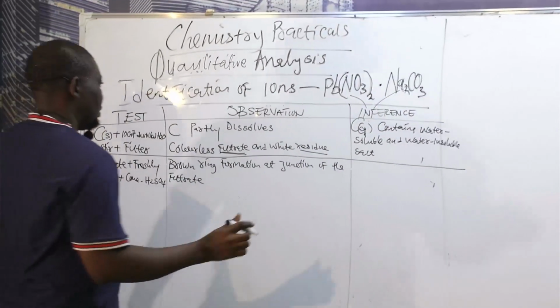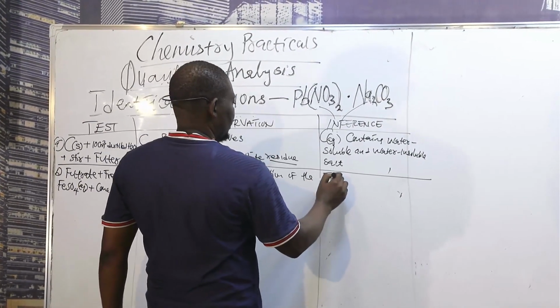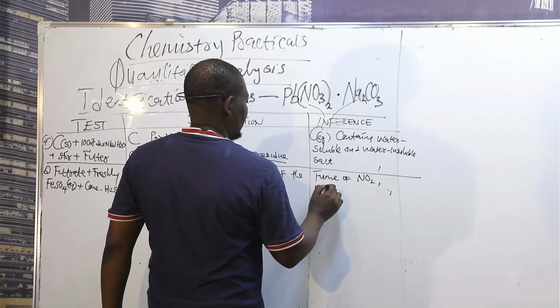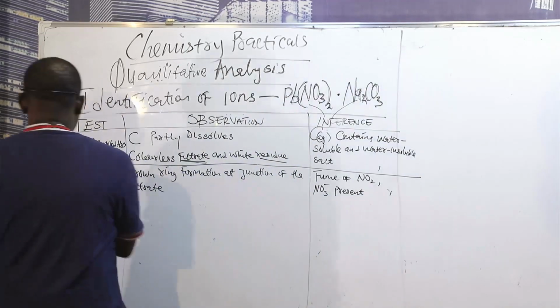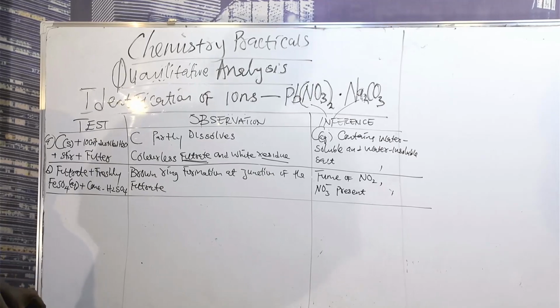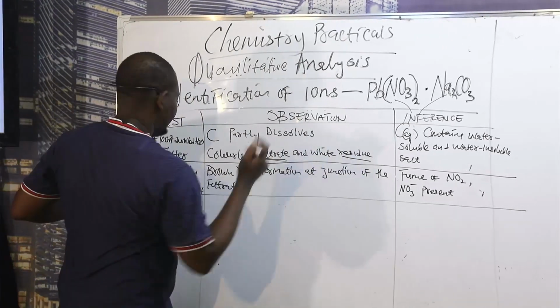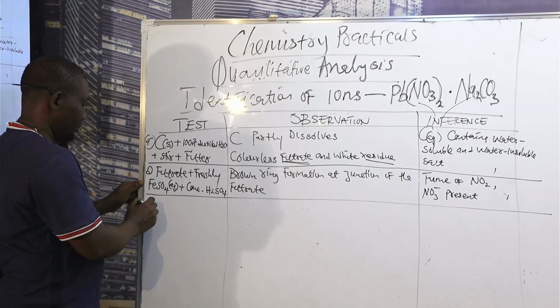Okay, so that means there's a fume of gas. So the fume of NO2, NO3 minus present. Okay. Then that is it. Then for C parts, you work on this. Okay, you work on this.